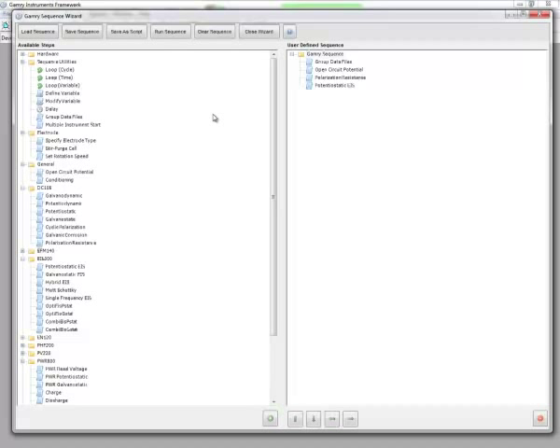As I explained in the first video, the Sequence Wizard is a great way to string together a series of experiments or loop a series of experiments for time, cycle number, or user defined variable.